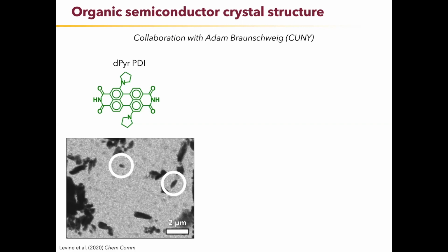So in this work, they basically used the same material they used to make the thin films, with similar processes, and instead of putting it on their normal substrates, they put it on a TEM grid. So we're looking more closely at the structure of the crystalline material that would end up in their thin film than if they had grown a larger crystal for X-ray.